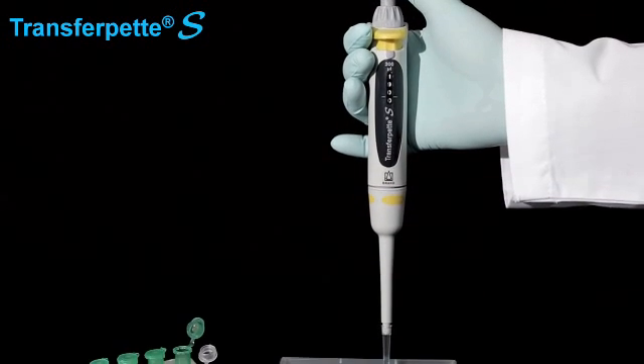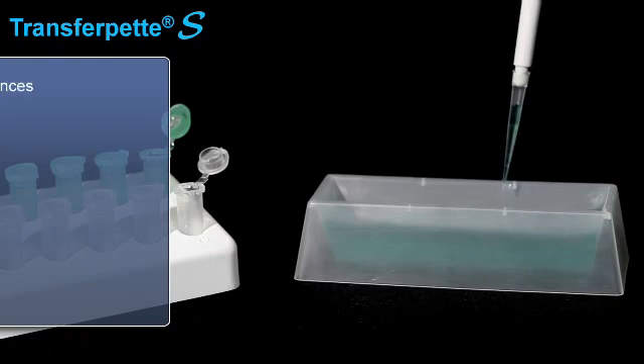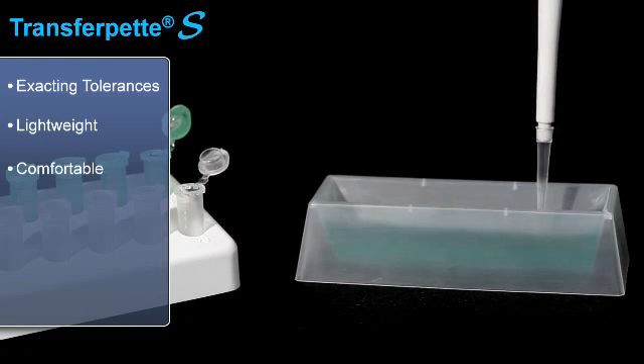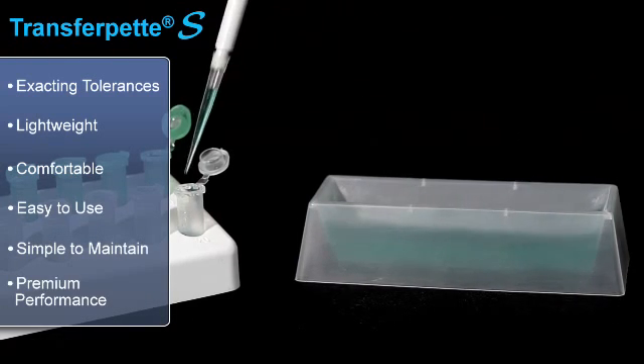The TransferPet S Pipette incorporates advanced materials and innovative design features. Manufactured in Germany to exacting tolerances, it's lightweight, comfortable, easy to use, simple to maintain, and delivers premium performance. It's also fully autoclavable.